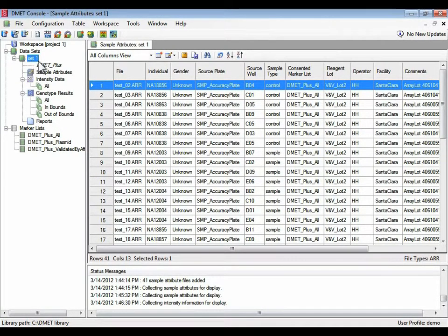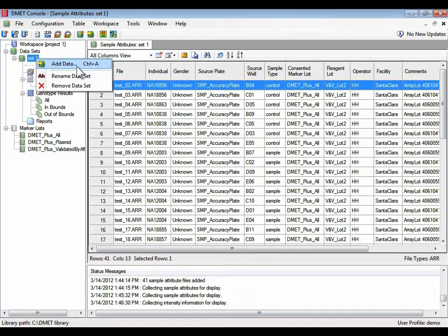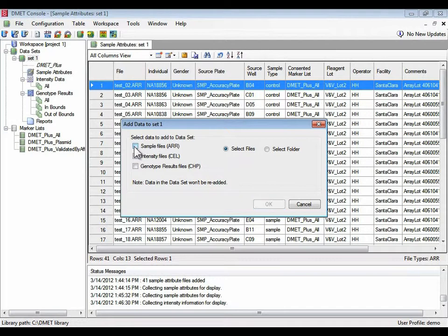I will frequently do things by right-clicks on relevant sections. So now I'm going to add additional data to data set 1. This time I'm going to add the cell files.